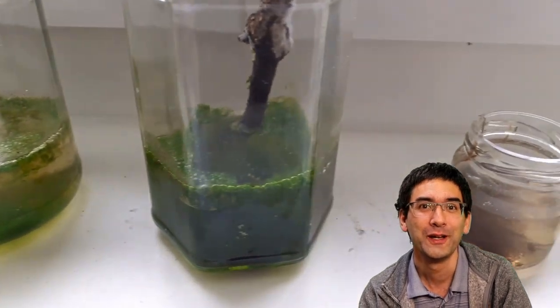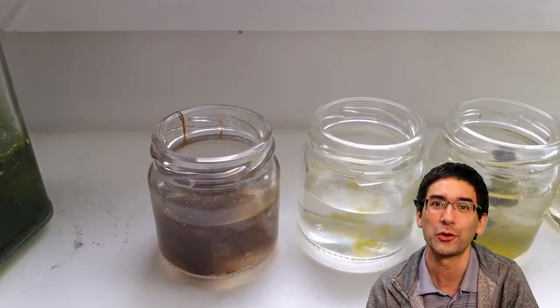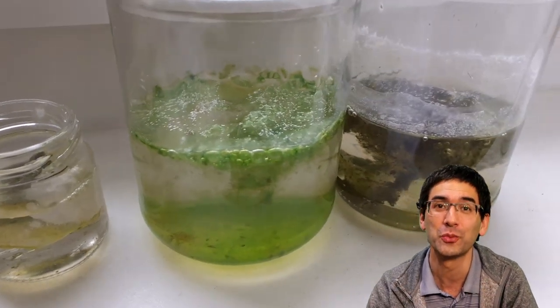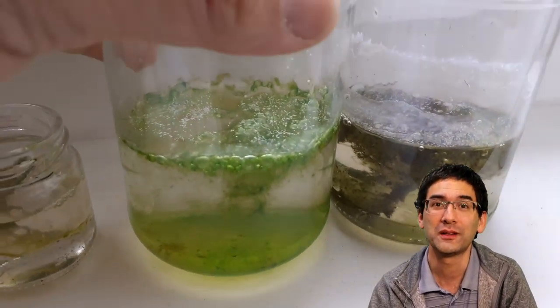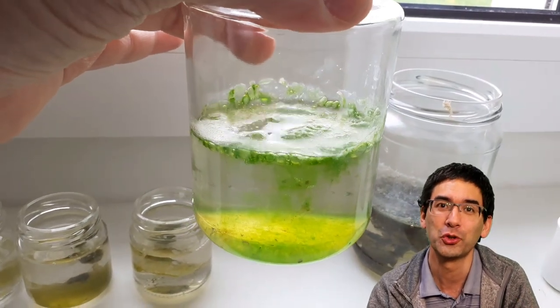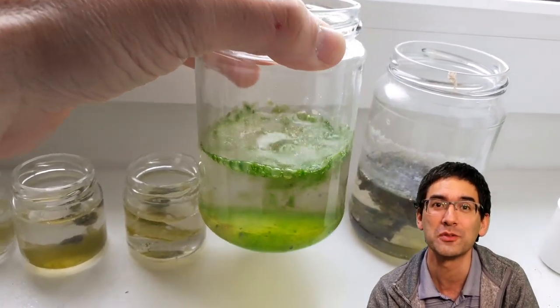You can see it in the different types of colors that I have here – different types of algae started to grow. It also has to do with the light conditions, the temperature, maybe the type of substrate that you're using. This different color simply shows you that evidently different organisms are growing there.